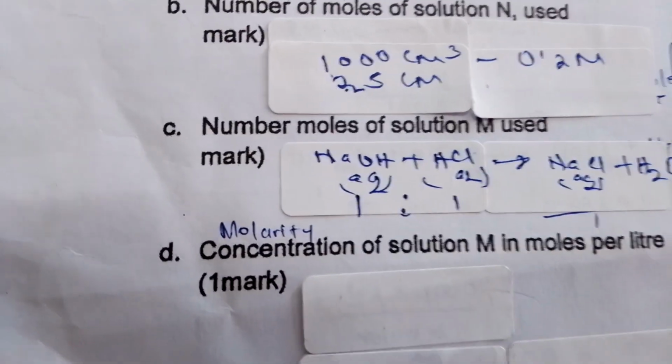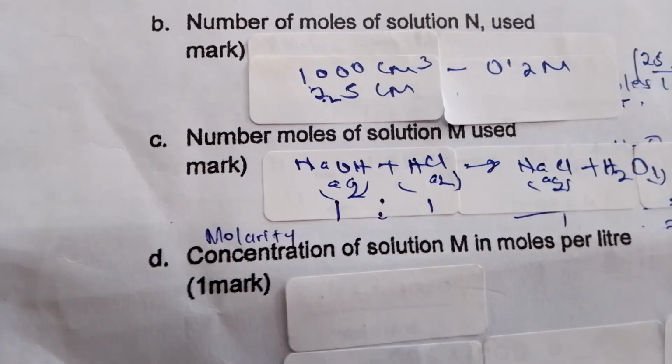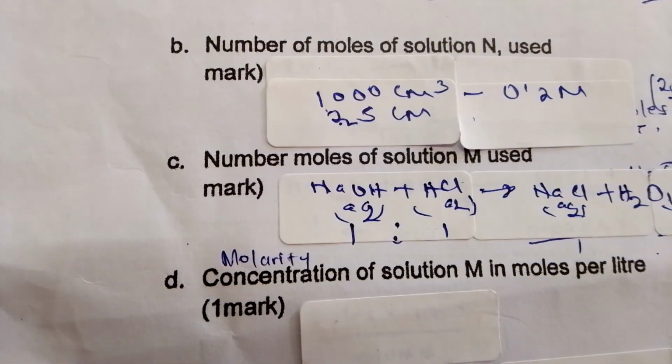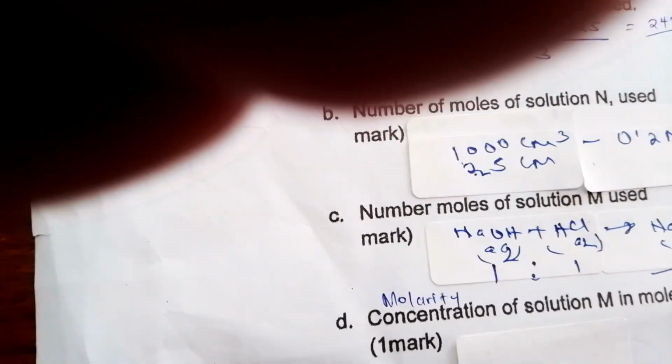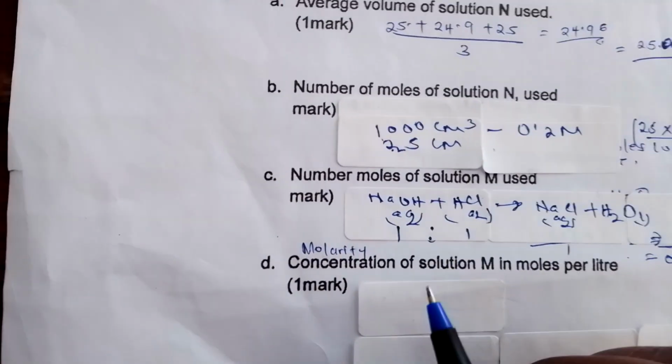Then we come to the concentration of solution M in moles per liter. We now need to calculate the molarity, or just the concentration.